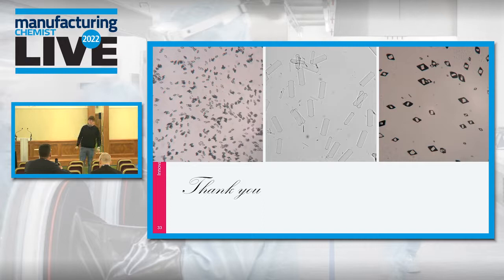So if Pfizer were to come to you and say, look, could you do a crystallization screen on 500 milligrams of material, could you do that? I would certainly say so, yes. We've definitely done crystallization on similar sizes. How many crystallization experiments we could do, that might take some time to decide, but we could definitely do at least one with that.